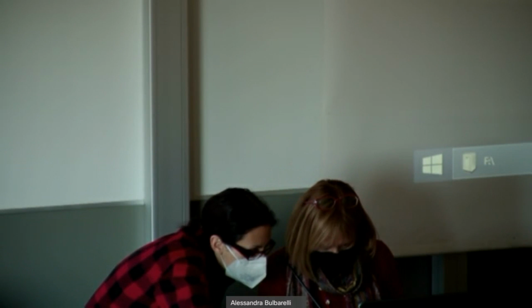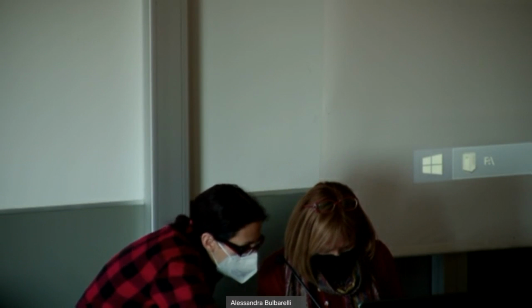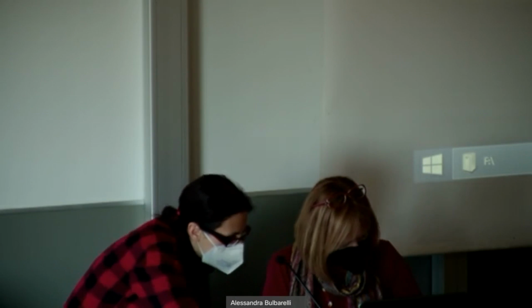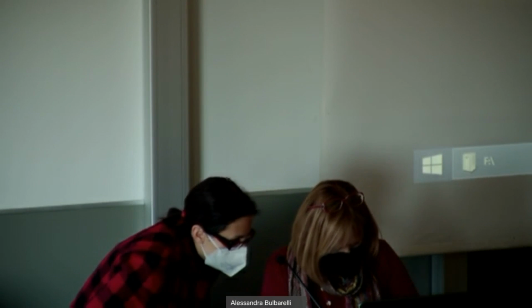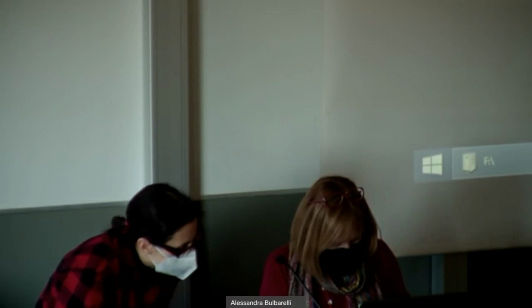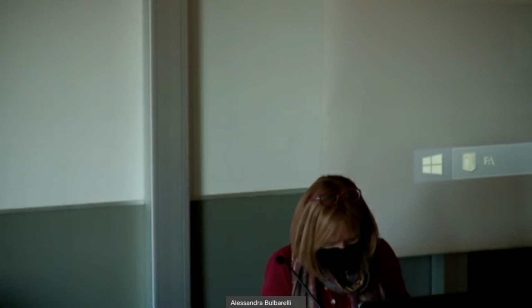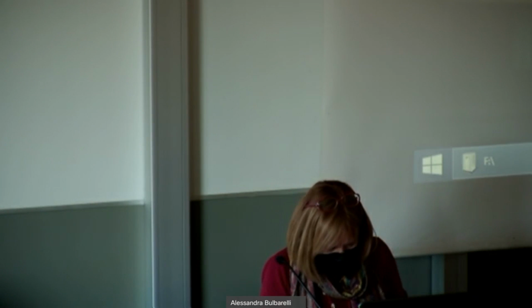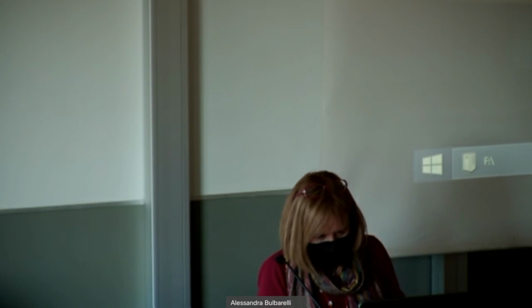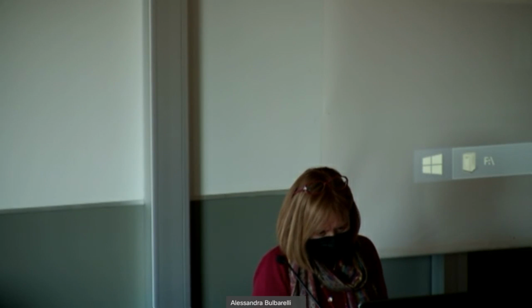So in your opinion, again, I'm not an expert, by adding more and more data, can we expect that this software or algorithm will give us important information also for clinical impact or use with an unsupervised approach, or do we have to deal with supervised, that is information that we need to give, so kinds of cells, stromal features, and so on and so on. So I don't know in the future.